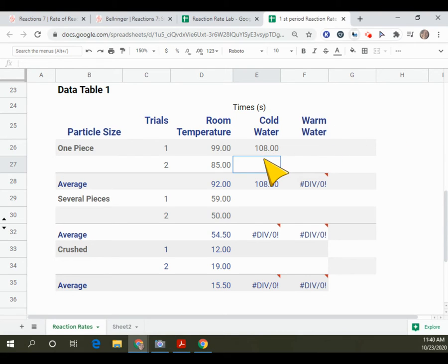That data might be a little bit skewed because a little snafu with not pouring in the water at the right time. Okay, so we've got our empty beaker. We've got our ice water. Try to get the right amount of water there. Okay, we're going to actually pour in the water first this time. Okay, and then we have our piece of antacid tablet. Ready, set, go.